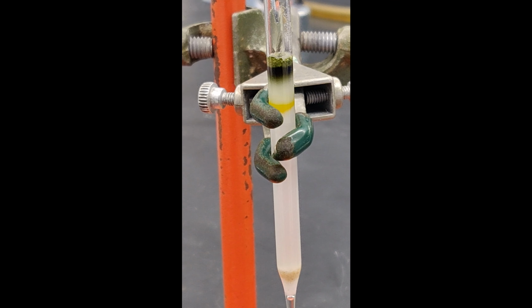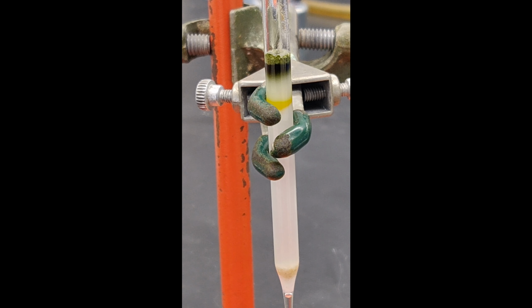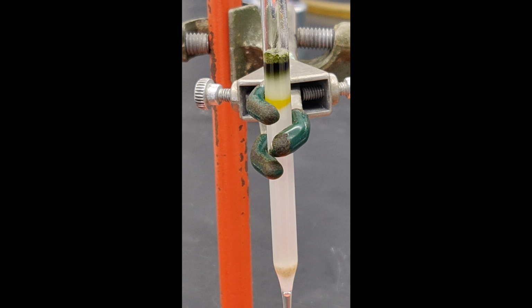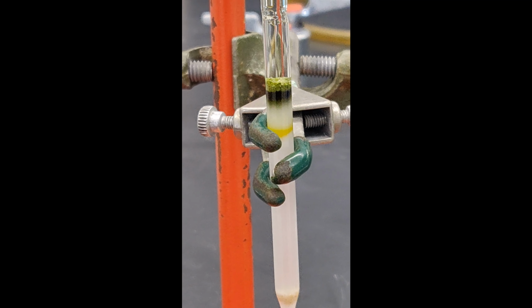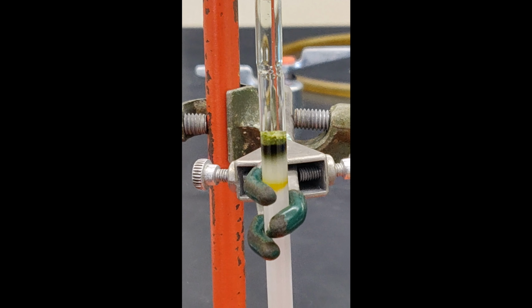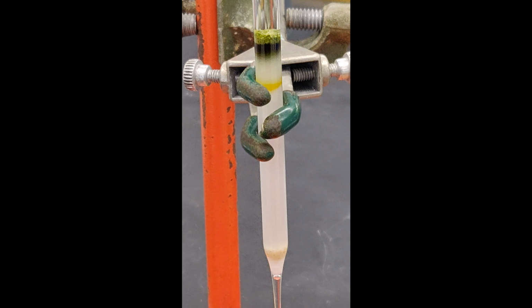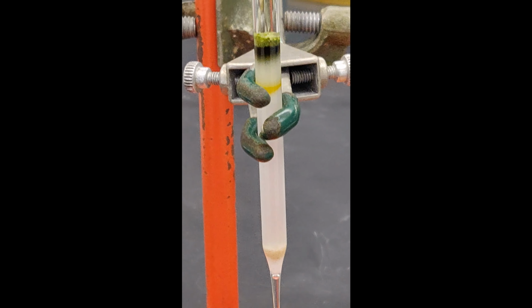Now that the pigment is completely loaded on the column, you can fill the empty space above the silica with a solution that is 9 parts Ligroin and 1 part ethyl acetate, the first eluent. Let the column slowly drain by gravity into a clean, dry 25 milliliter Erlenmeyer flask.